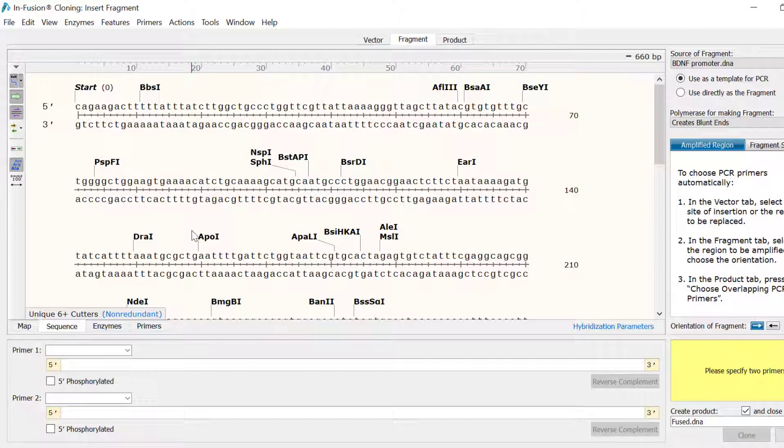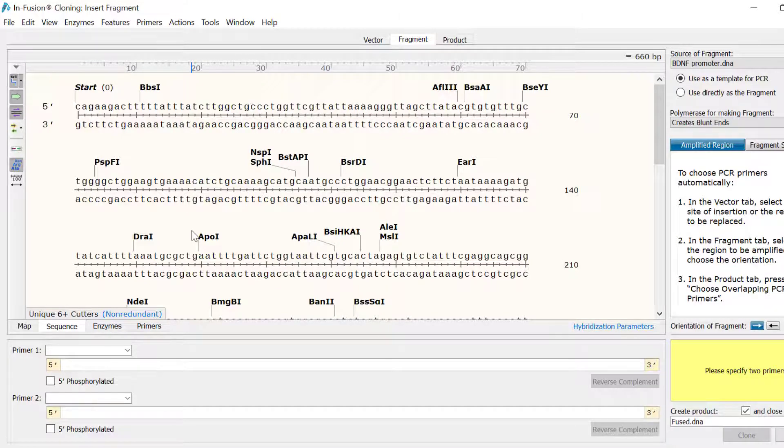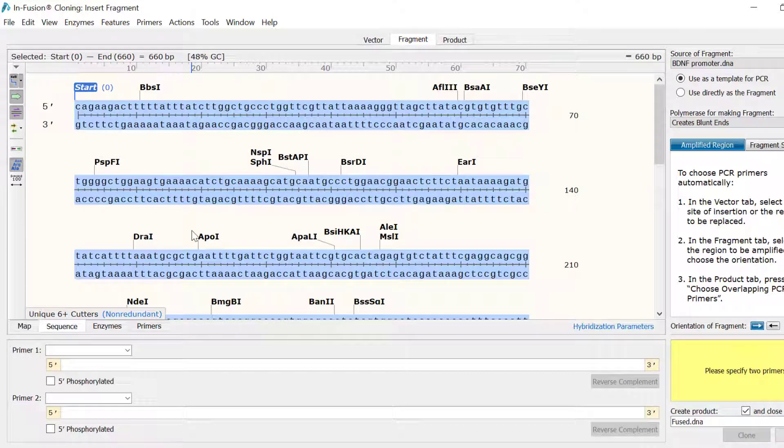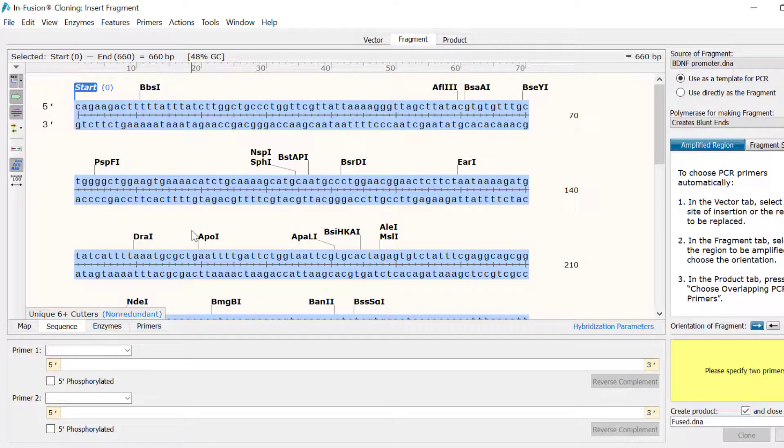In this case, the whole sequence is required, so I will press CTRL and A on my keyboard as a shortcut to select the whole sequence.